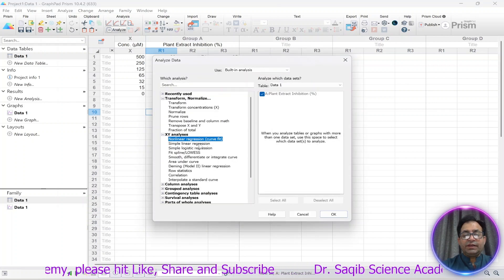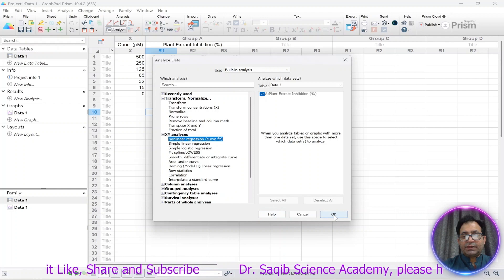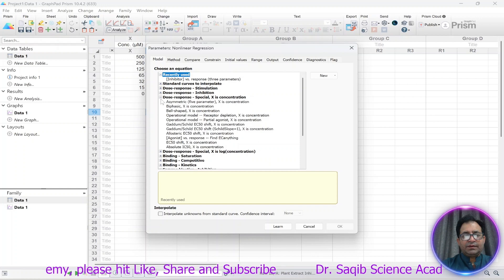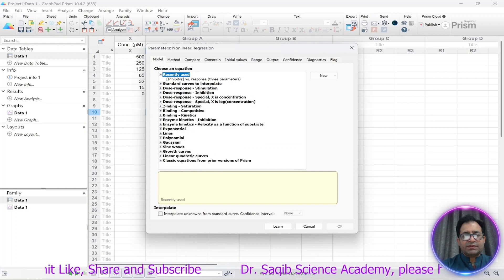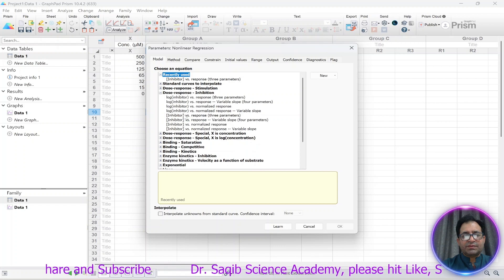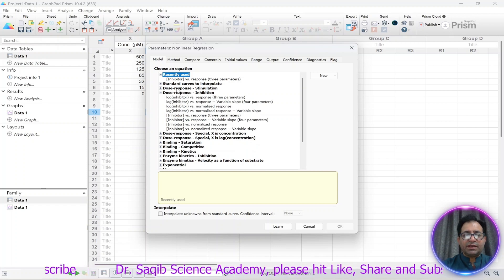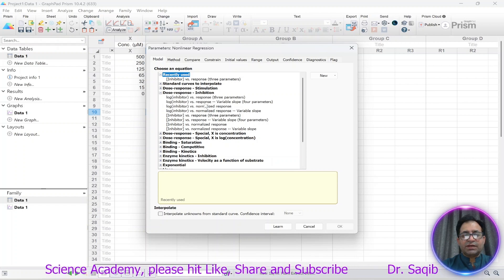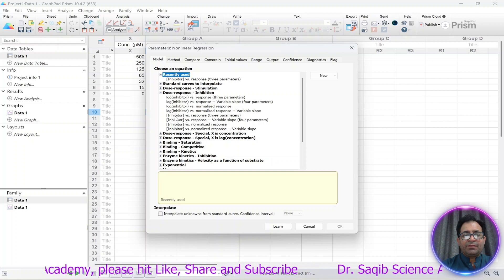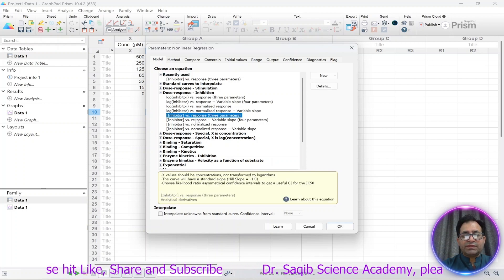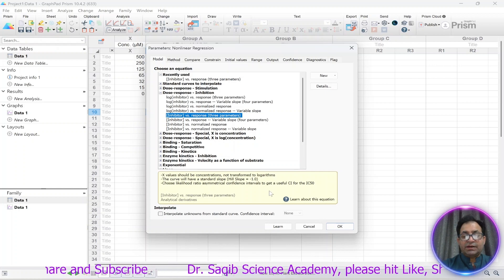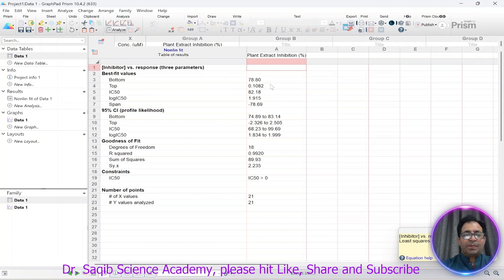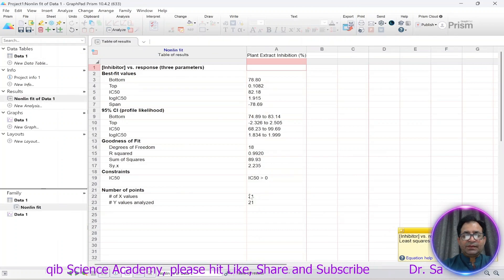We will analyze this using non-linear regression. We select dose-response inhibition. Under dose-response inhibition there are different parameters — log inhibitor versus response — but since we have inhibitor concentration we will select 'log inhibitor concentration versus response'.